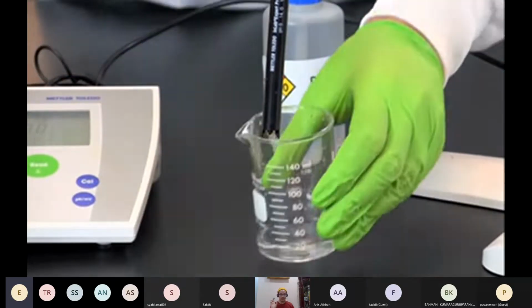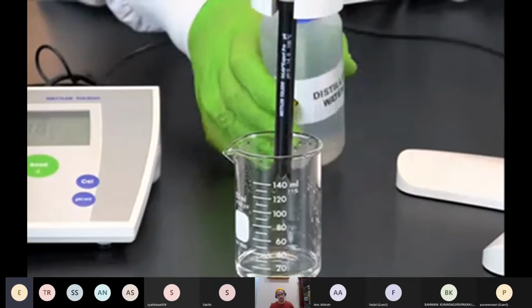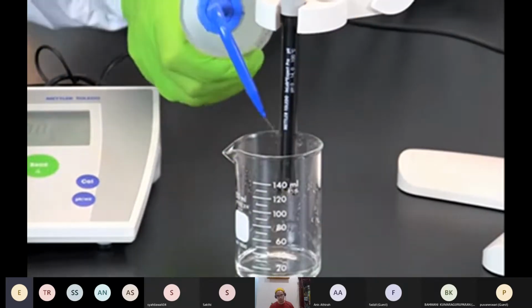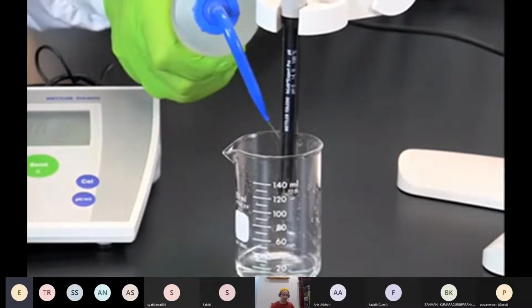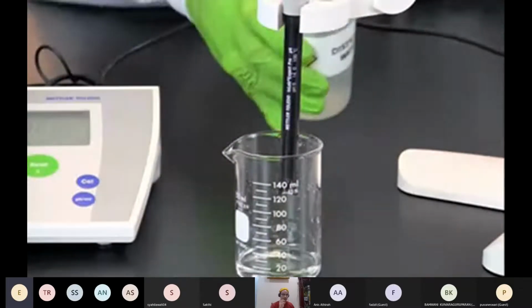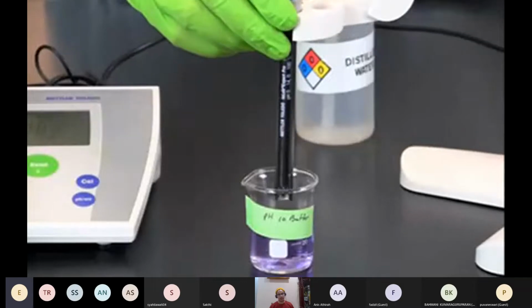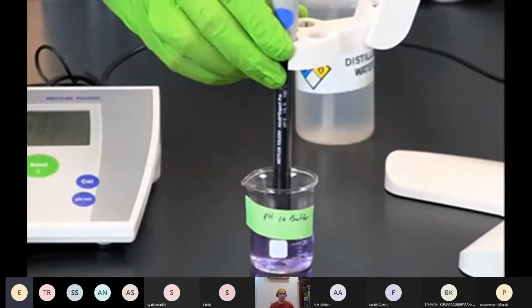Kalau pH buffer solution tu pH-nya 7, bacaan pada meter kita pun mesti keluar 7. Kalau kita test pH buffer 4, bacaan yang keluar pada meter pun mesti 4. Kalau kita test buffer solution 10, bacaan pH pada meter pun mesti 10. So that is calibration of the pH meter. Kita ambil bacaan of a standard solution.